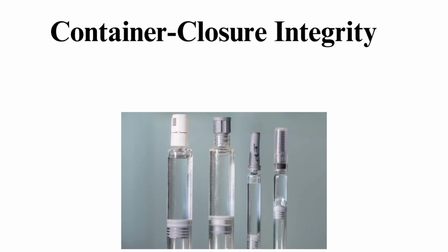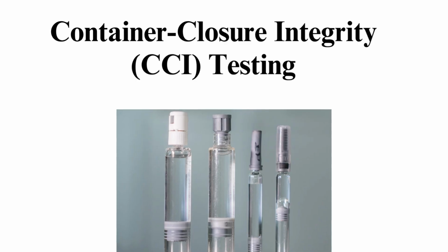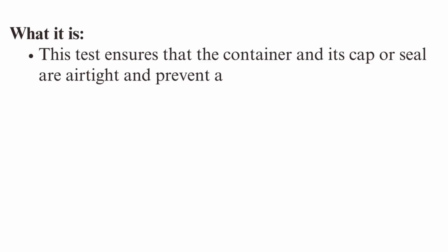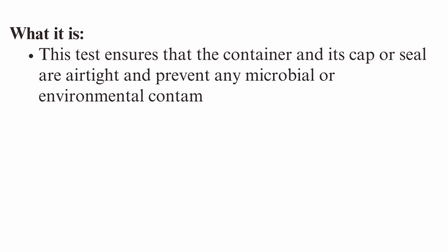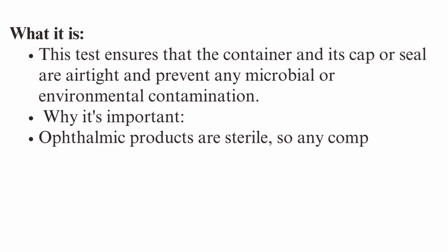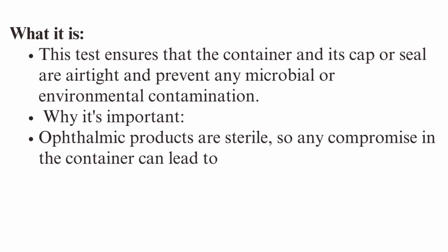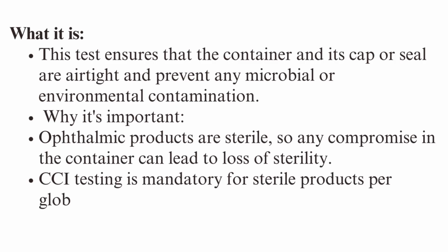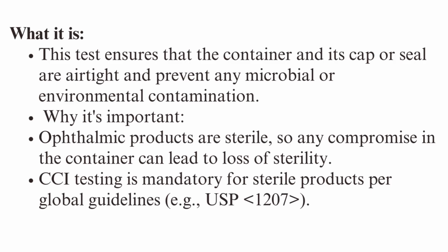9. Container Closure Integrity, CCI, testing. What it is: this test ensures that the container and its cap or seal are airtight and prevent any microbial or environmental contamination. Why it's important: ophthalmic products are sterile, so any compromise in the container can lead to loss of sterility. CCI testing is mandatory for sterile products per global guidelines.